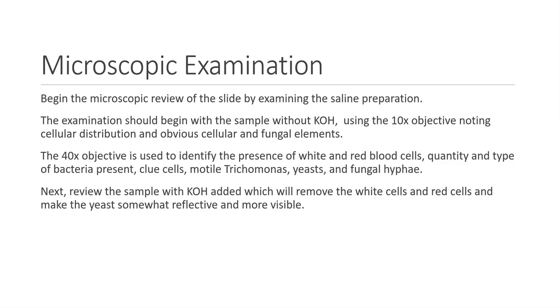Next, review the sample with KOH added, and this will remove or cause the rupture of white cells and red cells and make the yeast and other structures somewhat reflective and more visible.